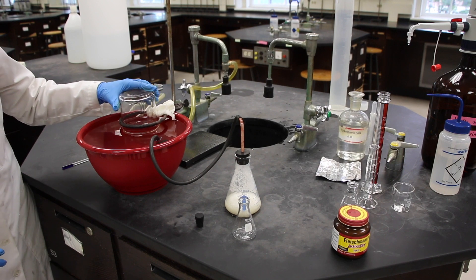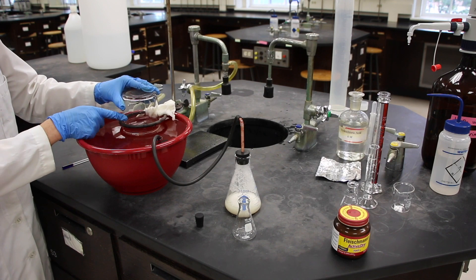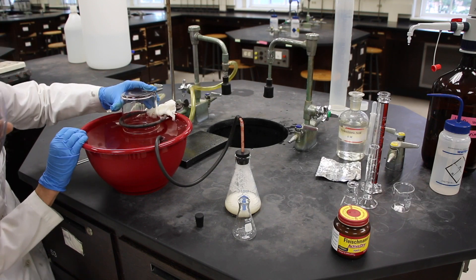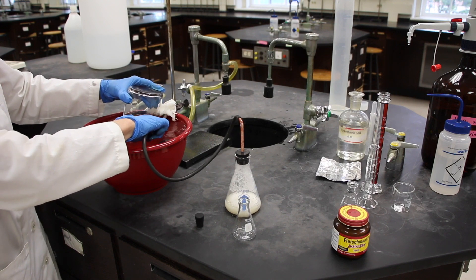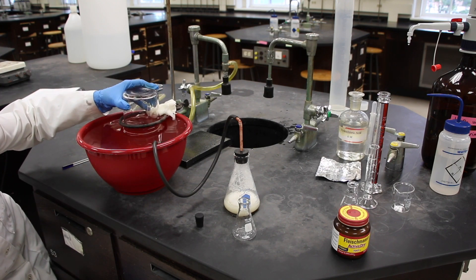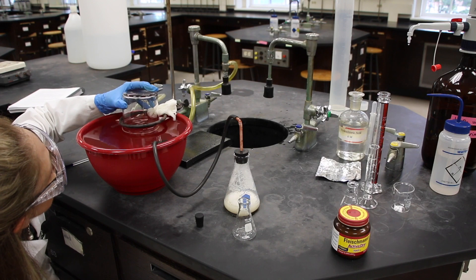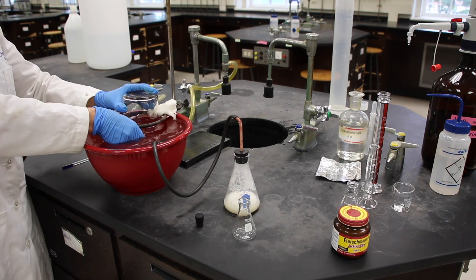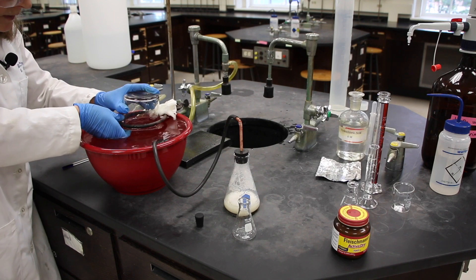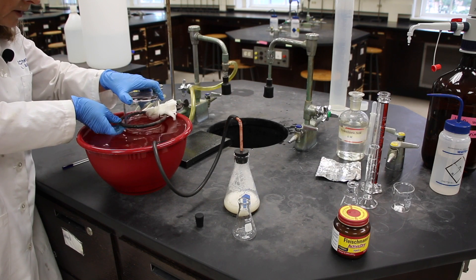So what we'll do now is we need to equalize the level of the water in the bowl and the water in the bottle. That will ensure that our pressures are the same. I'm going to do that first by removing the delivery tube so it sits a little bit lower. It looks like they're about equal now, and I'm going to move the rubber band to that level of water in the flask.